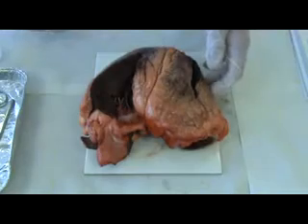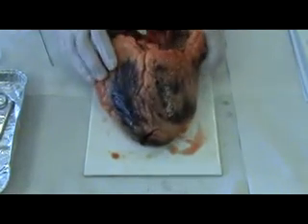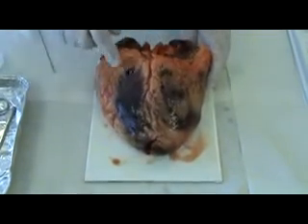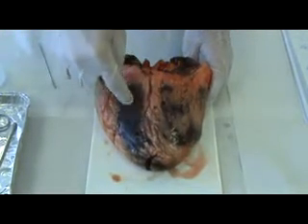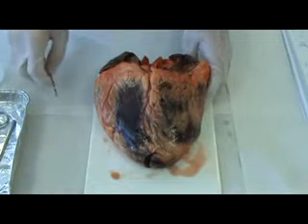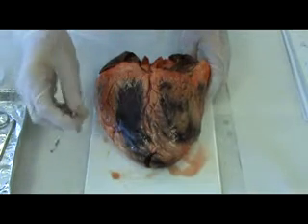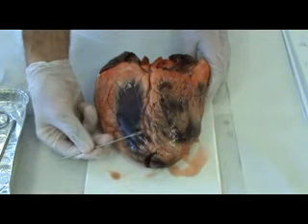If we turn the heart around to look at the posterior view, we notice that this smoothish area is covered by a very thin membrane, the pericardial membrane. This membrane is important, as you can see there.